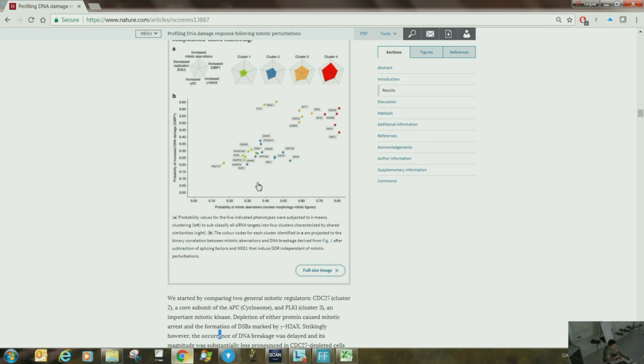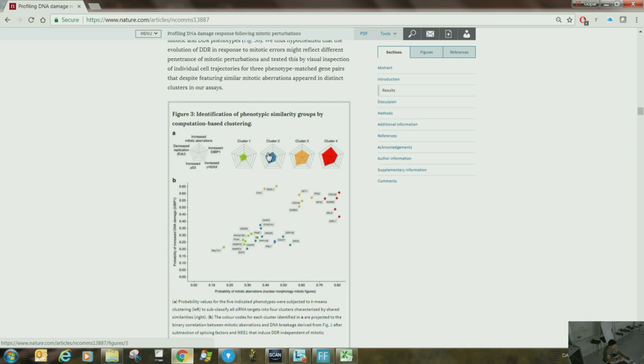There are some things like, for example, the clustering, right? Maybe you do not want to use bins to give a color, but you want to use a cluster. That is not possible in Spotfire. So what you have to do is some kind of MATLAB script, and generate a column which would tell what cluster they belong to, like a particular number of cells, and then you come back to Spotfire and use color by cluster class, and then you will see nice clusters. Okay.